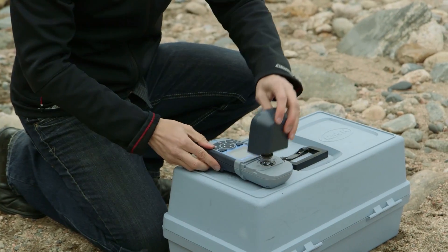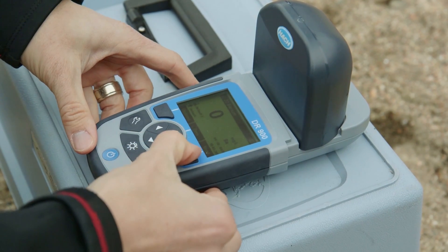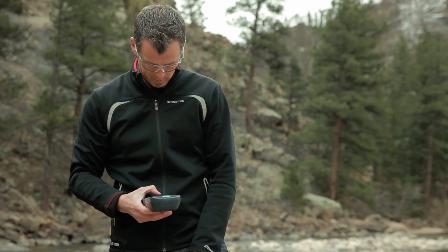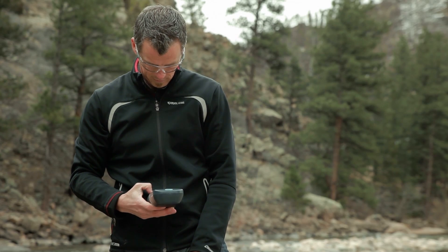We use a consistent and simple to use portable testing interface to make your daily testing easier. An improved user interface allows for quick selection with one hand.